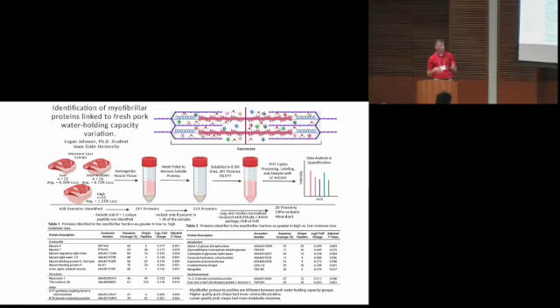Yeah, that's probably one limitation to this. Again, we're trying to identify majorly abundant proteins, not proteins that are more different. But that is something. Learning a little bit more about the imputation, I think, will help maybe modify some of the analysis that we do here. But we're really trying to look broadly, and so really seeing proteins that are expressed more greatly or that are more abundant in this fraction is what we're really looking for. And so we're less worried about proteins that are less abundant because they might contribute significantly less to some of that ultimate phenotype that we're seeing.